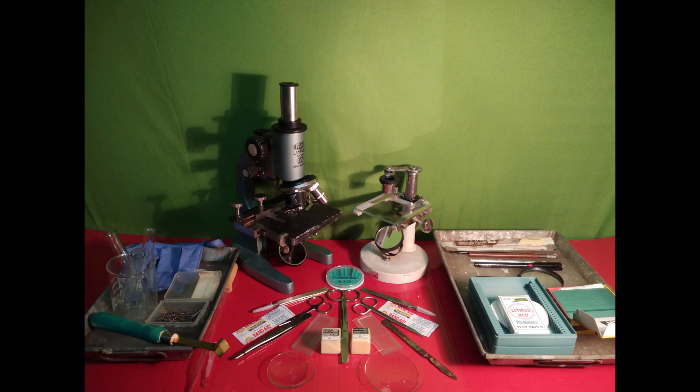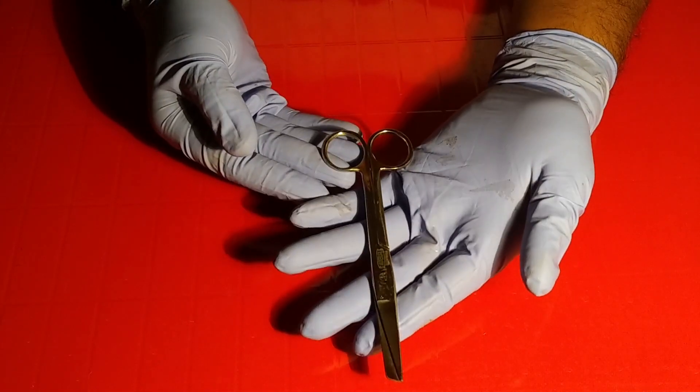Welcome to Zubangla. In this session we will focus on different instruments used during practical zoology or any field of biology. We will start with scissors. The first one is the vertebrate scissor.